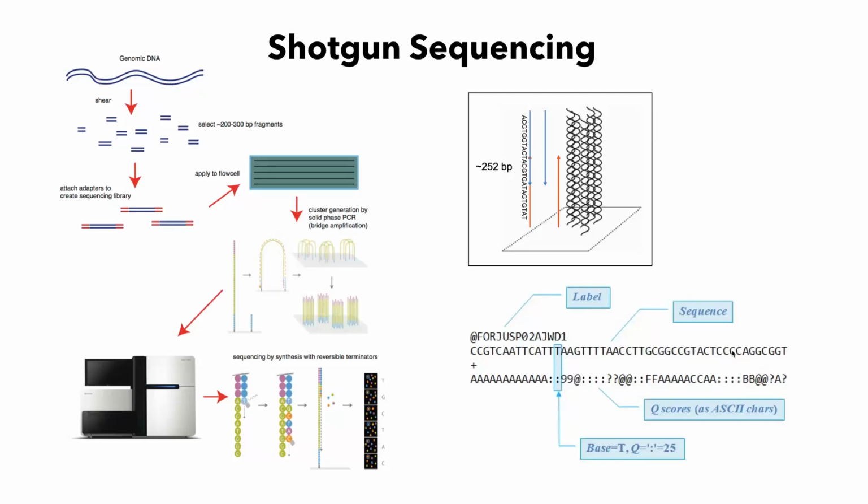Also, we will look today at two types of sequencing: single-end sequences and paired-end sequences. Single-end would be sequences that are read from one side, and paired-end would be where the same sequence is read from both sides. That technology is considered to be more reliable because now you have the same sequence read twice.